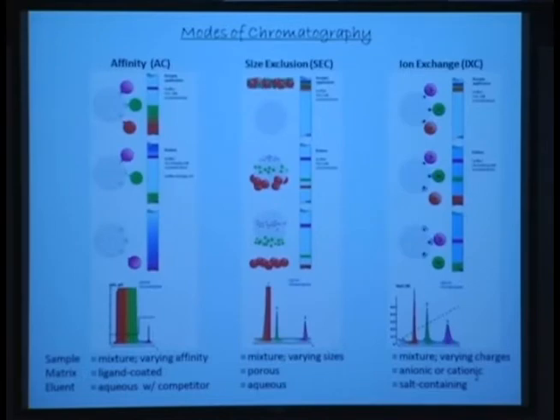Do you get everything back when you lyophilize? Some of it is lost in lyophilization also. So you lose 5 to 10% in lyophilization. So every step you lose quite a bit, indicating that it is really a challenge to prepare these glycans to a very high extent.